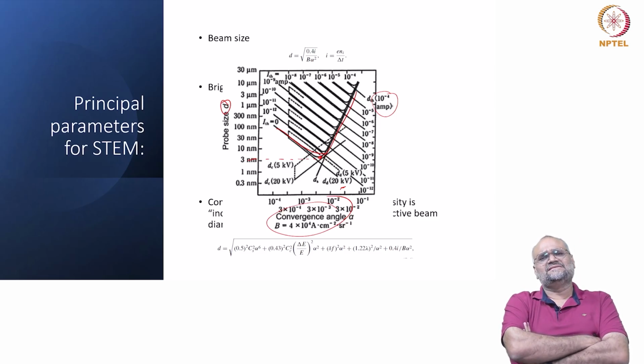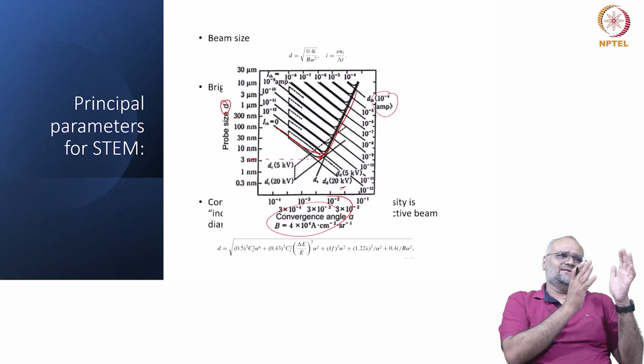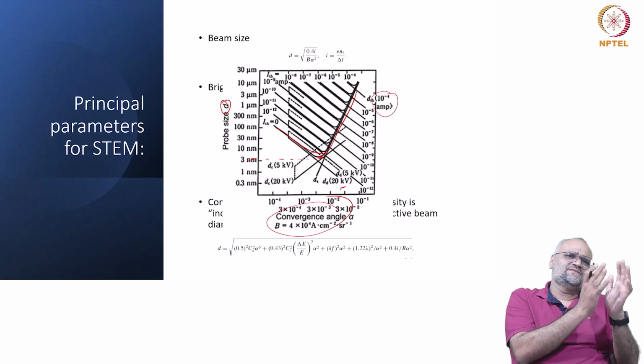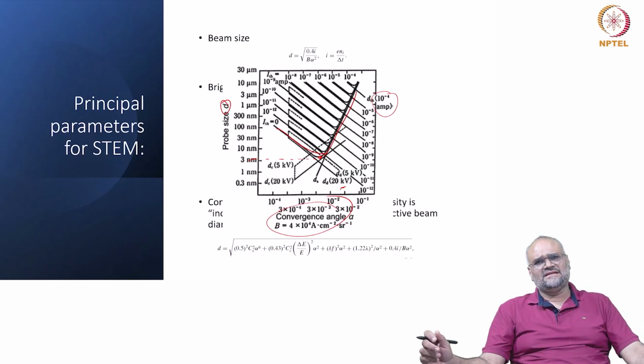Similar ideas exist in STEM as well, but the only difference is the way the interaction volume is depicted slightly varies in STEM mode, whereas when I look at it in TEM mode, it is different. We saw the weak phase object approximation. The same kind of multi-slice approach to model HR-TEM can also be used for HR-STEM as well. So let me try to relate the electron beam interaction with the specimen in TEM mode and STEM mode through something called the reciprocity theorem.